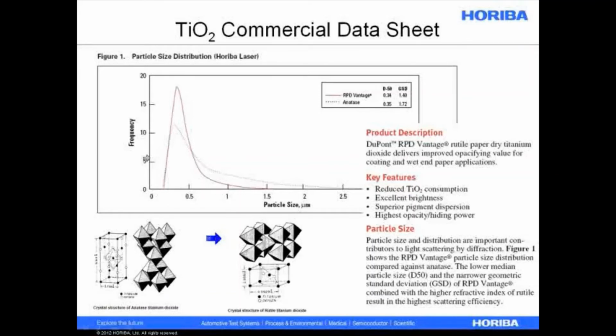And what they're showing here is two different grades of this titanium dioxide showing particle size as measured on the instrument it seems they're using to do these measurements. That's not an endorsement from this company. This is just pulled off. They put that name right on all of the batches of all of the products that they ship for TiO2, because I believe they use quite a few HORIBA laser diffraction analyzers to keep track of the particle size of their titanium dioxide.